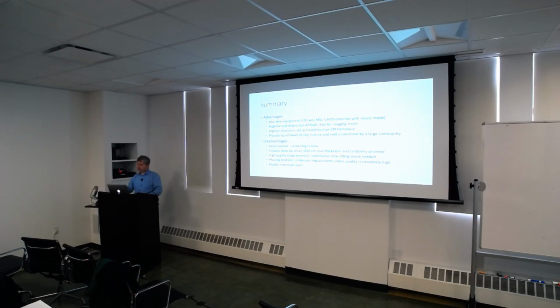Yeah, I've seen that somewhere, flexible, but then the crystal locks it. Yeah, I've seen that a lot. But then how do you know it's not caused by the crystal? It's better than no structure, put it that way. You have to do your due diligence in biochemistry, obviously.